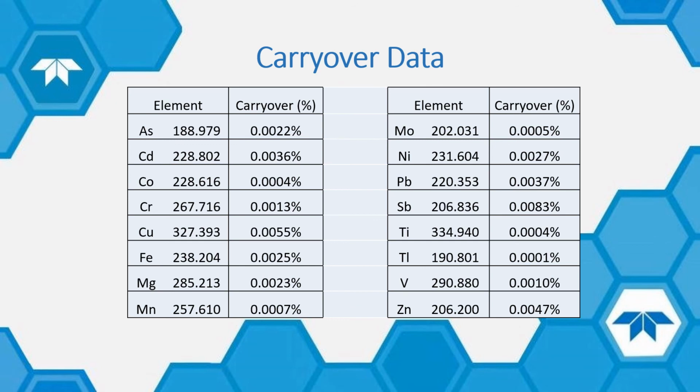But when we analyzed them on the ICP, we made sure to separate the preparation blank from after the high standard from when the high standard was analyzed itself. So the preparation blank was actually run after another blank to ensure that any carryover we did see would be isolated to the sample preparation and not the sample introduction.